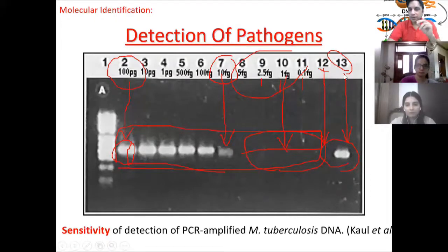In number 13, for example, if I am analyzing the SARS-CoV-2 virus, then in one tube, I will put the sequence of the SARS-CoV-2 DNA there. I will put the DNA with the same sequence of the SARS-CoV-2 virus in one of the tubes. Not the virus, but the product of the sequence of the viral genome.